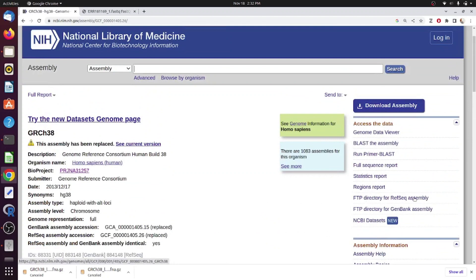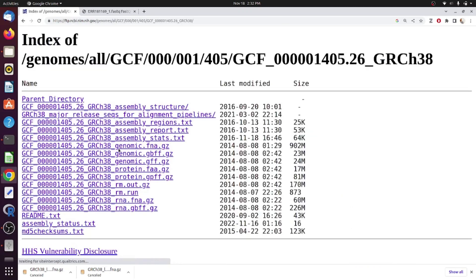From here you can go to the FTP directory and find the genome of interest. After clicking the FTP link you will find multiple sequences and annotation files.